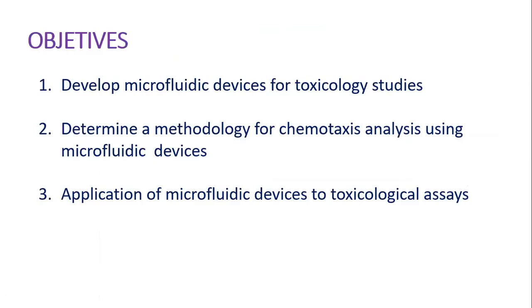So, with the aforementioned, we propose the following objectives. First, develop a microfluidic device for toxicological studies. Second, determine a methodology for chemotaxis analysis using the microfluidic device. And finally, the applications of this device for toxicological assays.